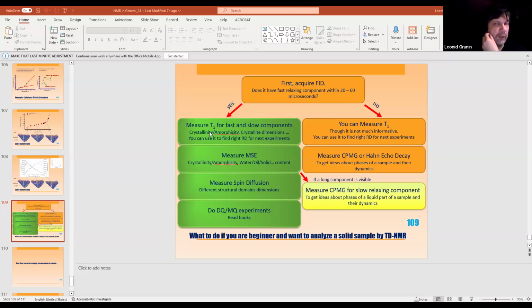In any situation we can just connect and see what's going on. Is Adriana now in Poland? Yes, yes, yes. So we can try to figure out what's going on. So she answered T2 is bi-exponential for hydrogen. And is it also bi-exponential for fluorine? It must be, because otherwise, the positions are pretty symmetrical.